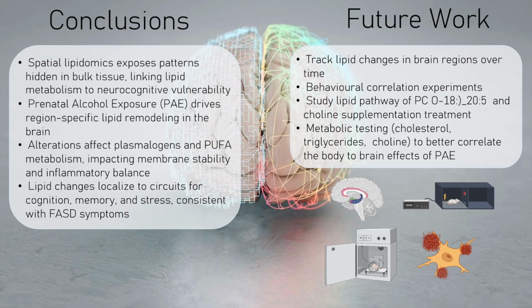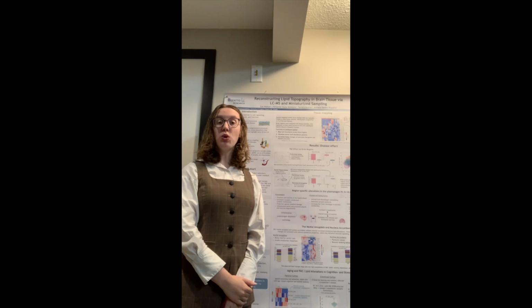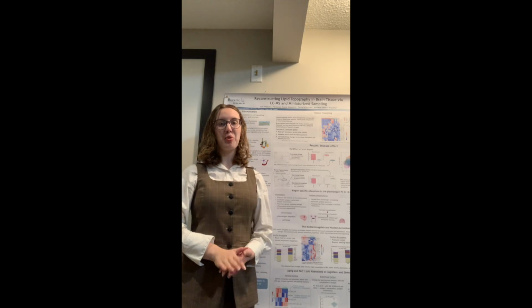A blood-brain lipid profile comparison also reveals that there is a metabolic effect that PAE has on the body not previously explored. Though we have made significant advancements throughout this project, there is a lot more to be done.